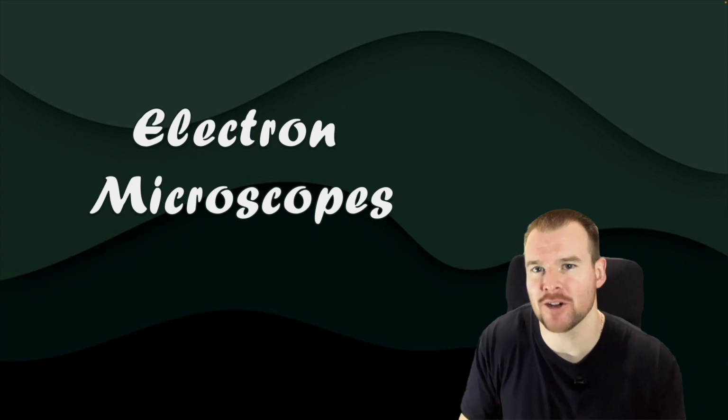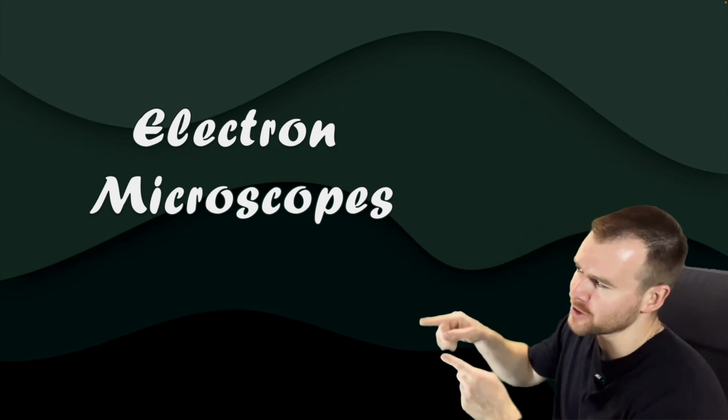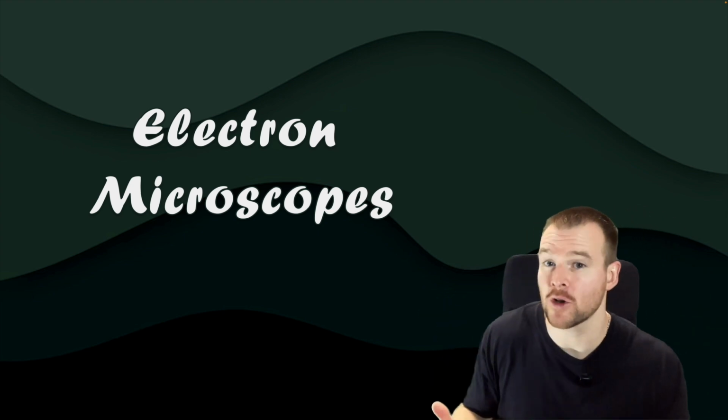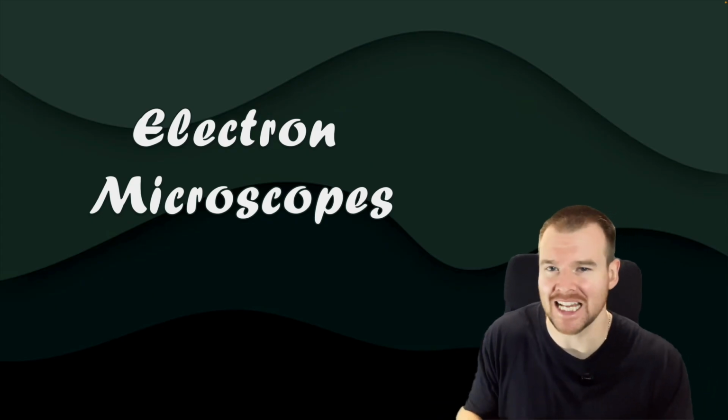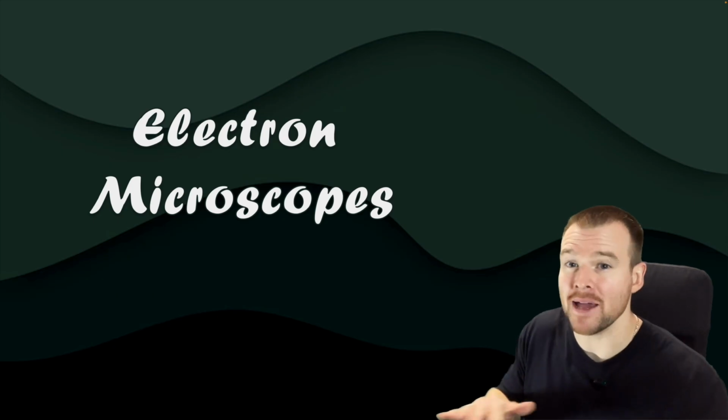Okay, that's it for light microscopes. We're next on to electron microscopes. The operation of electron microscopes requires some science that is beyond Science 10 that we're looking at here, the grade 10 level, but we'll start to introduce the basics for how it works.